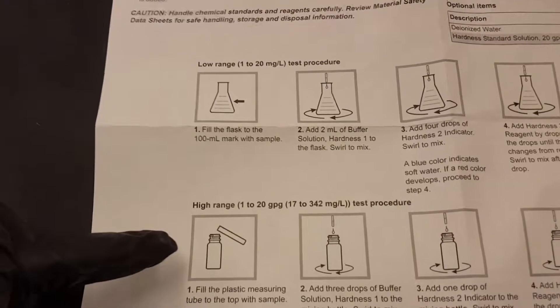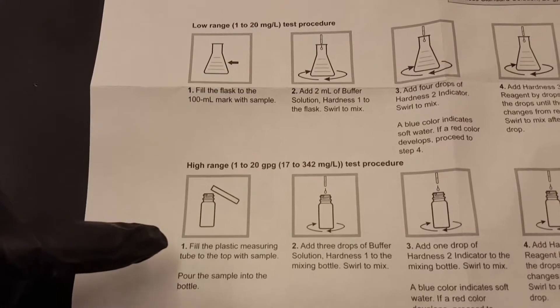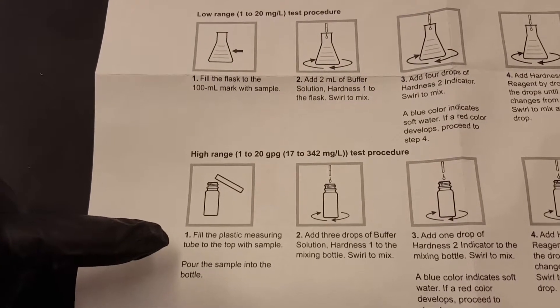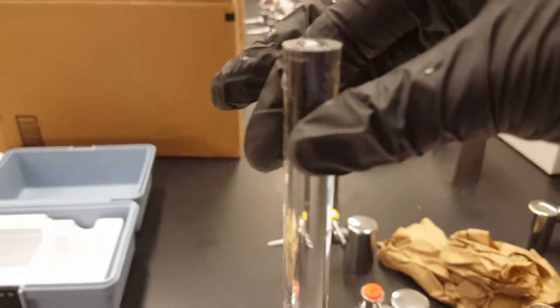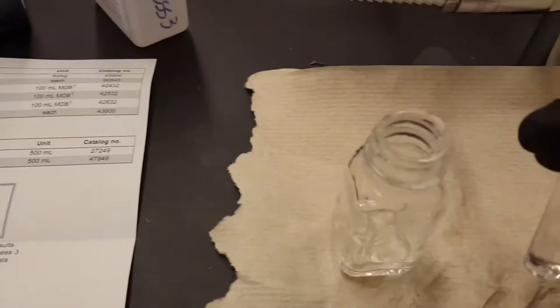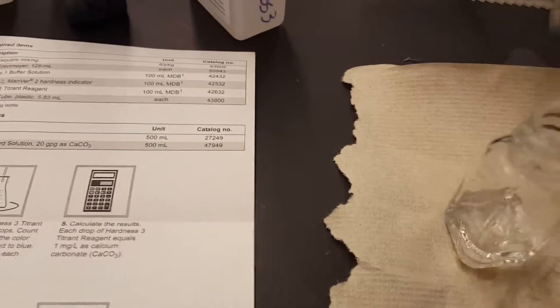We're only going to do the high range because we have very hard tap water here in San Bernardino. So the first step it says fill the plastic measuring tube to the top with sample. It comes with a little tiny tube like a little cylinder. Fill it to the top with tap water or creek water depending on what you are testing. Pour it right into this little container.